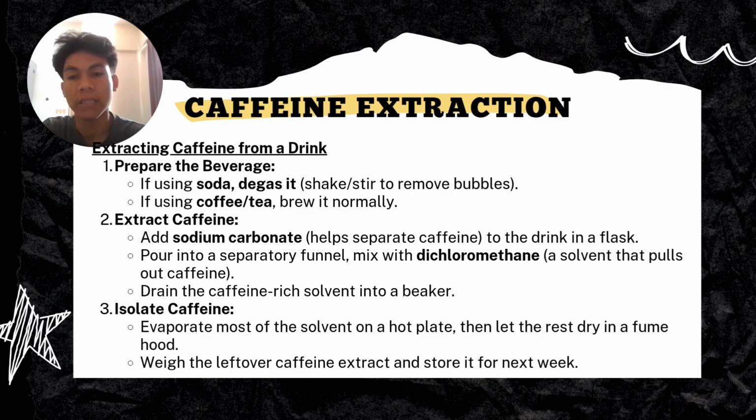The third part is that you need to isolate the caffeine. So you need to evaporate most of the solvent on a hot plate. Then let the rest dry in a fume hood. Weigh the leftover caffeine extract and store it for next week.